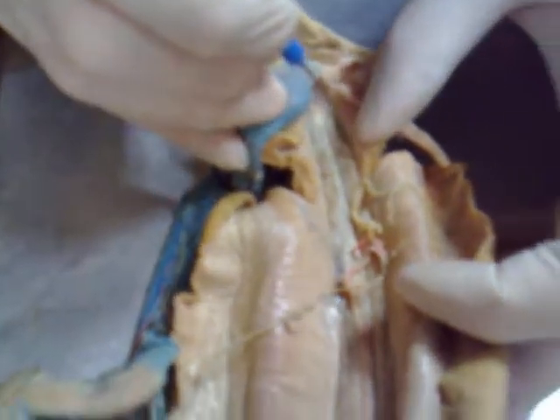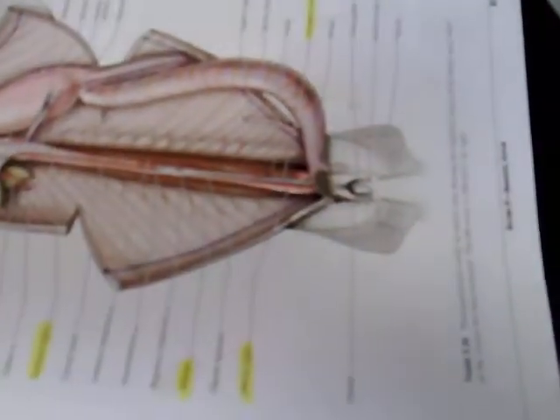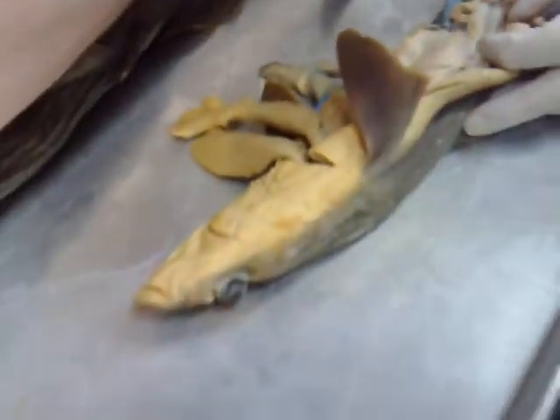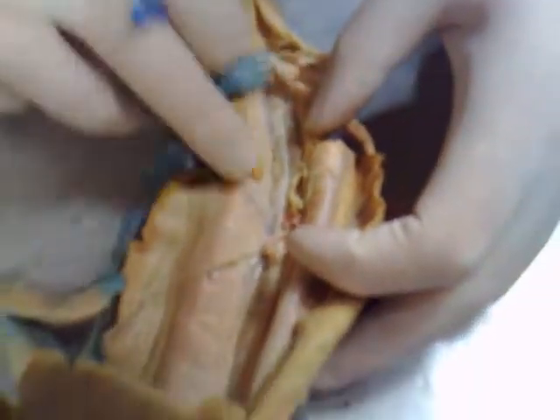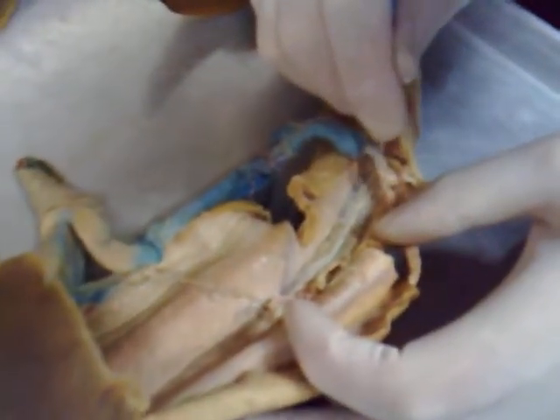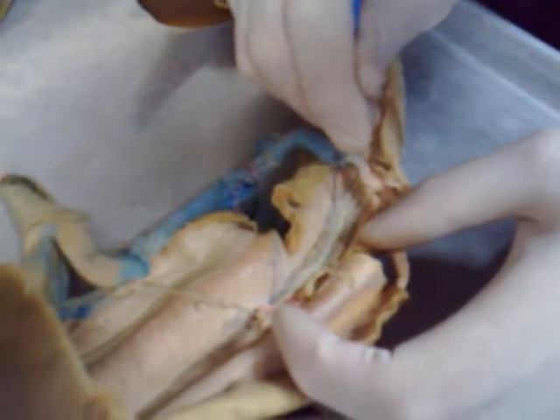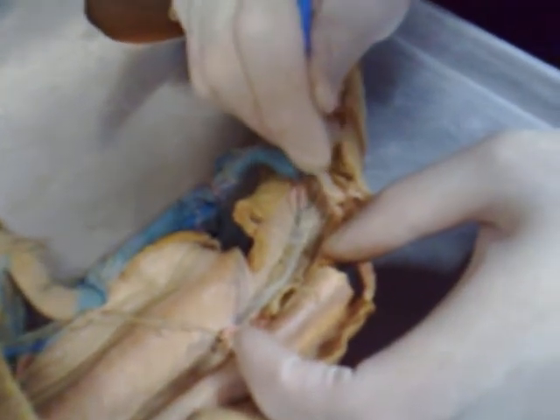There's a ligament here — this is the caudal ligament. The archinephric duct is very difficult to see. These things stink... but see that right there? Yeah, that's it.